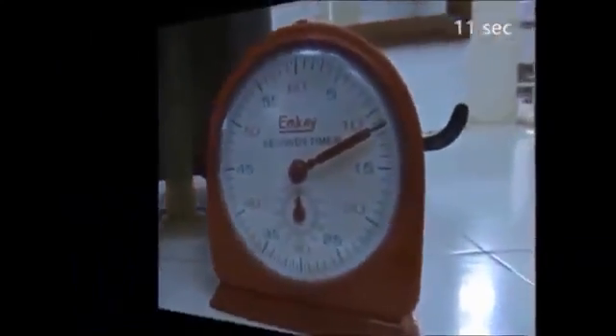This brings us to our last reading. Heating the apparatus up to 80 degrees, the time taken by 50 ml of glycerine drops to 9 seconds.